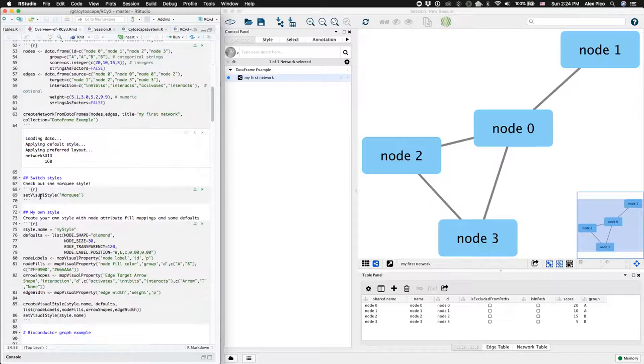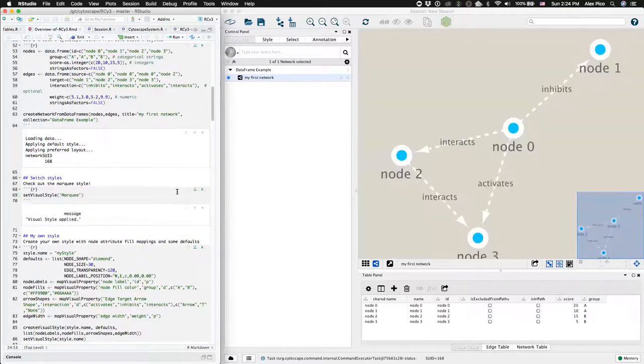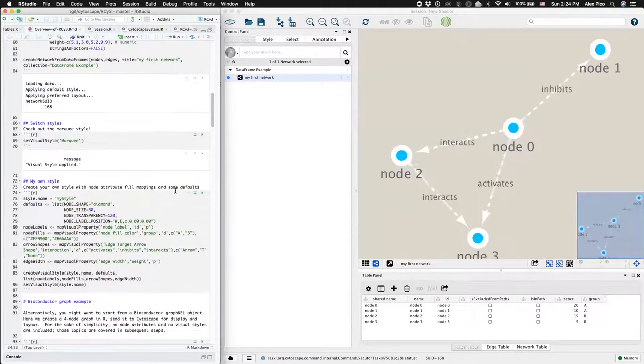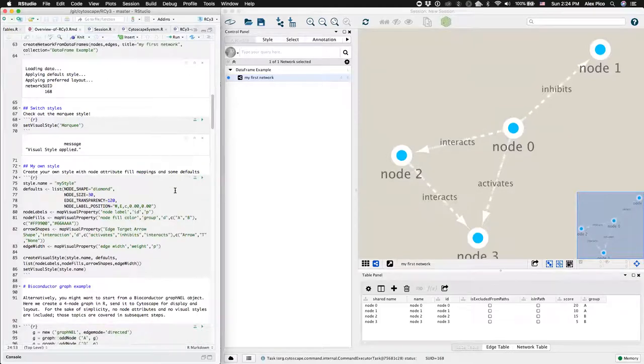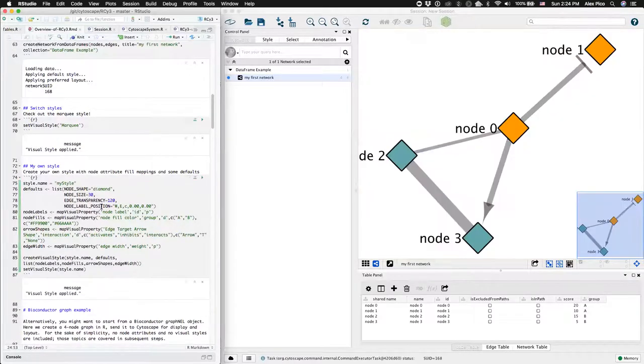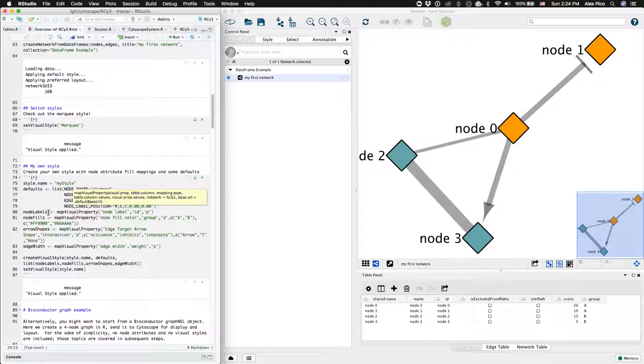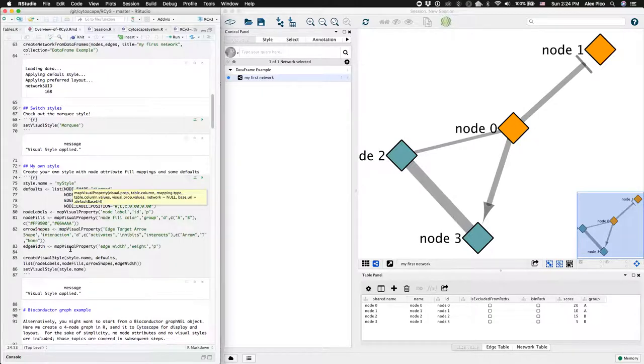You can set one of the pre-made styles, or you can define your own style. This chunk defines default values for a number of node and edge properties, and then mappings for node labels, node fill, and edge width.